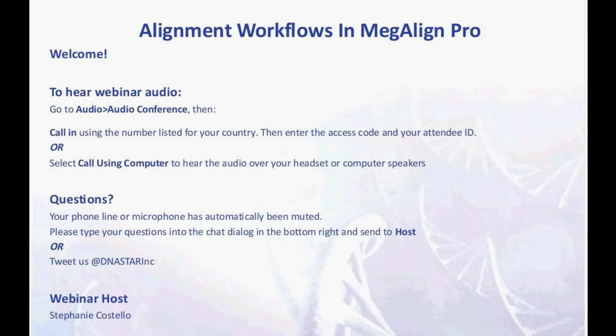My name is Stephanie Costello, and I'll be coordinating the webinar today. I'm here with Jackie Carville. She's on our marketing team, and she's going to be focusing on MegAlign Pro today. MegAlign Pro is one of our newest applications. She's going to go through several alignment workflows and different views in that module.